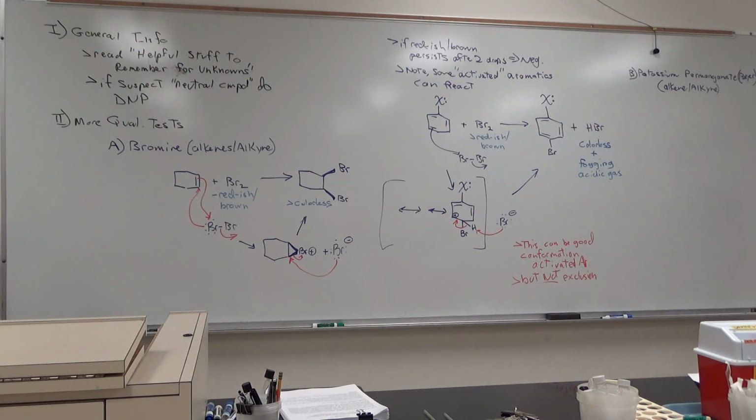Okay. So these, by the way, alkene and alkyne, is that one of our primary functional groups, or is that one of our subsidiary functional groups? Subsidiary. Okay. So we could have lots of them, we could have none of them, etc. So the Baeyer and the bromine test, along with Beilstein and ignition soot, you should do on all your unknowns, or both your unknowns. Make sure you do all four of those on both your unknowns.